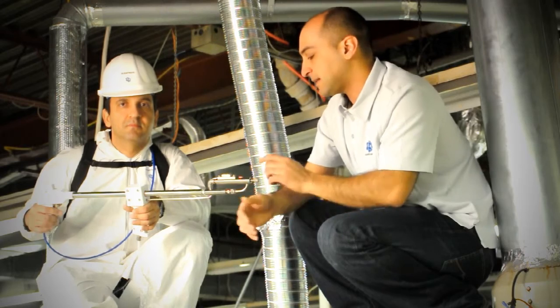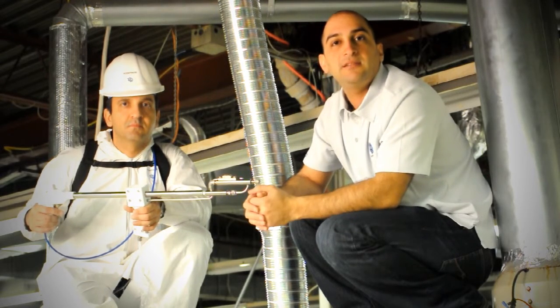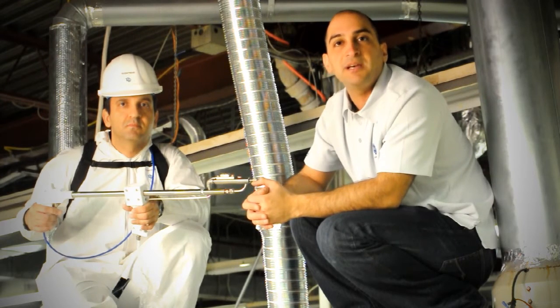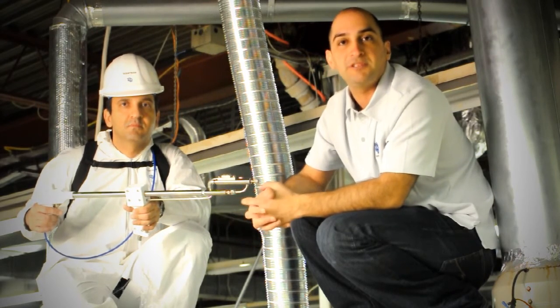So what the stack sampler does is take some of the sample from the stack and mix it in with clean diluting air or nitrogen. The point is that by mixing it in with this dry air, the condensation in the bag won't happen, and therefore your sample will be well preserved.